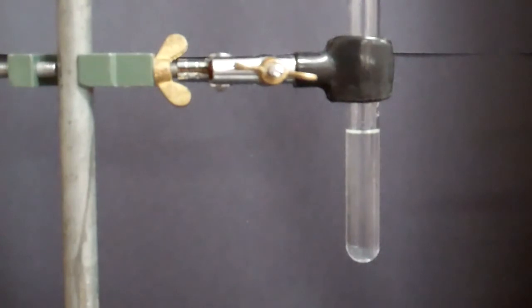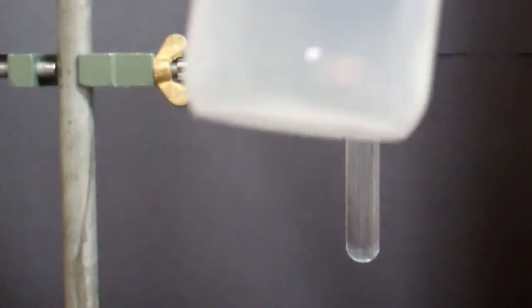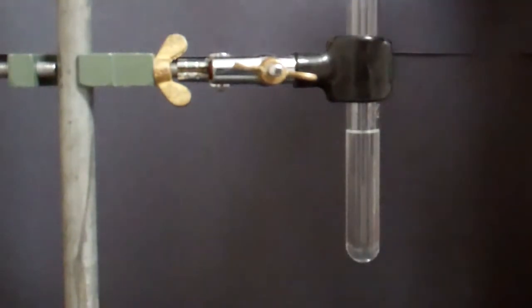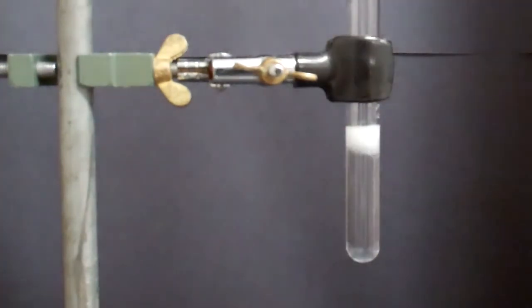Then add 3 drops of the barium chloride. Notice that immediately we get this white precipitate. You can stir that.